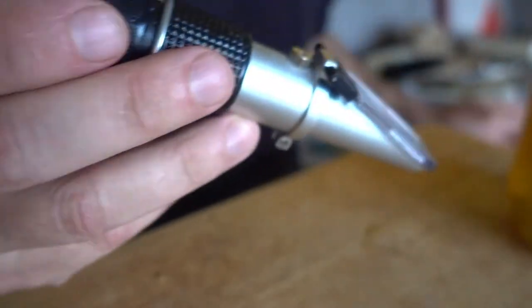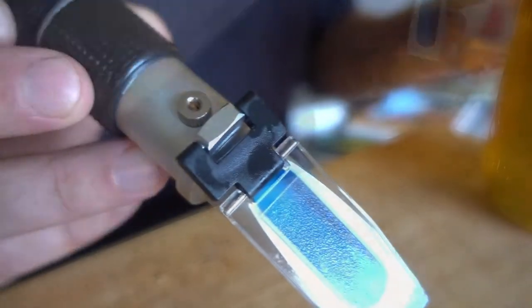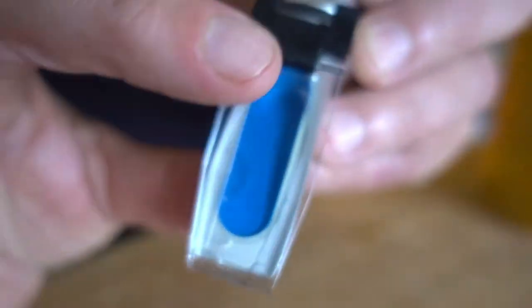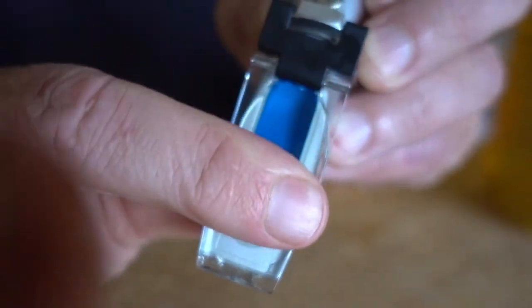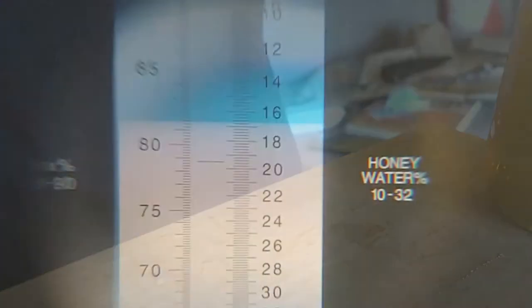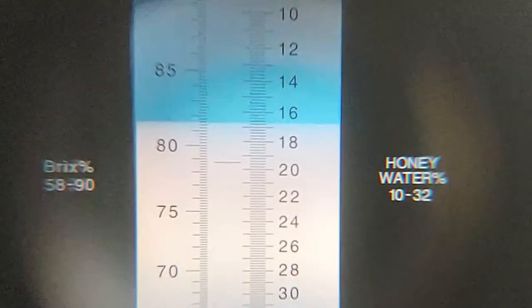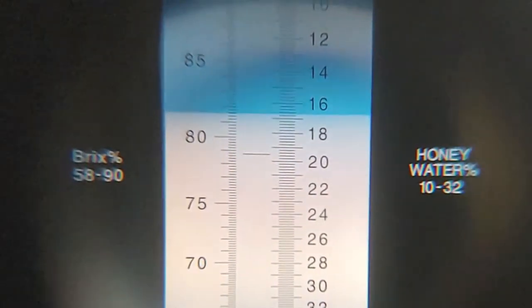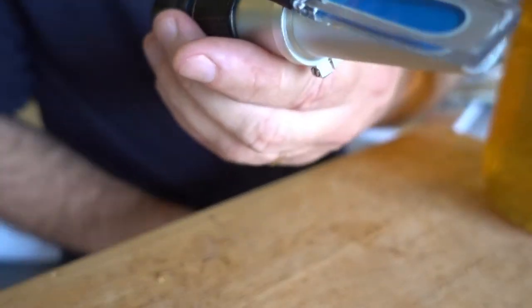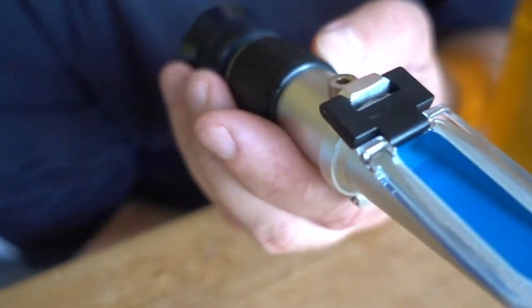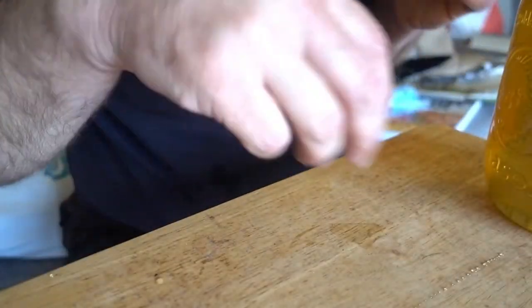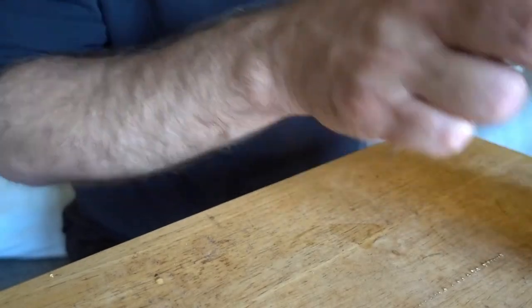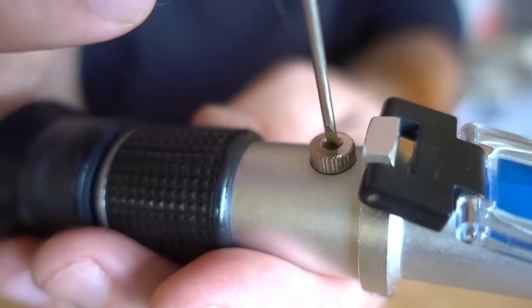Okay so the final test is to use some actual honey. Here's the thing, here comes the honey, boom, plop this thing down, give it a squish, make sure there's no bubbles in there, take a look. So that's coming in at just under 17 percent and I know that's not accurate, I know this honey is not that viscous. I'm going to take the screwdriver and adjust it right now.